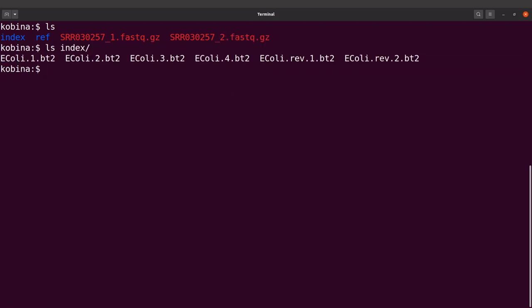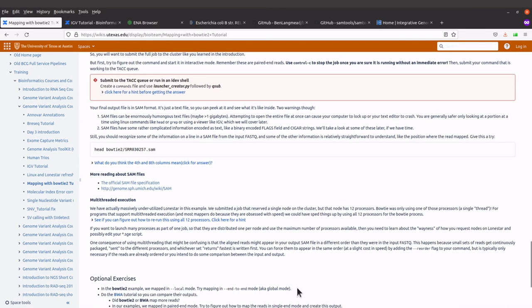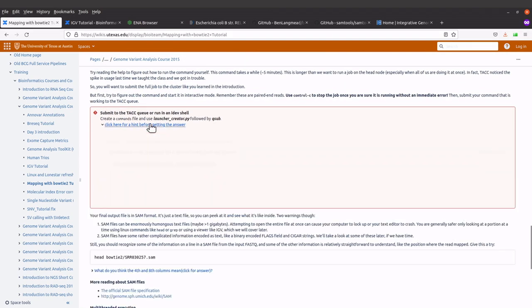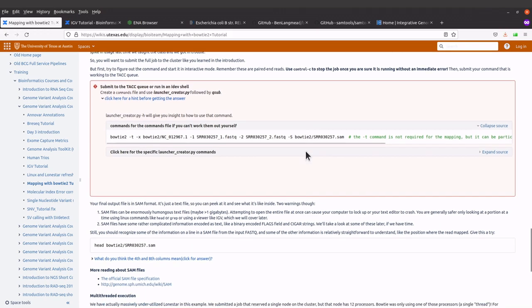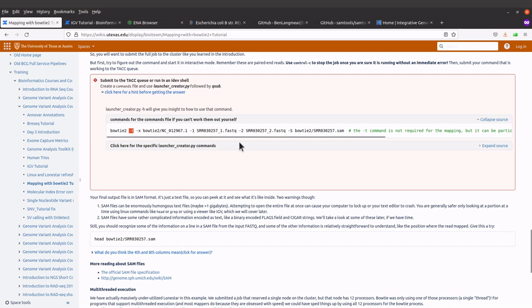Now we're going to perform the mapping. Let's check the command used for genome mapping from the tutorial page. The command calls bowtie2, then specifies the index, then -1 and -2 for the paired reads, and also the output file. The -t flag we're not going to use in this tutorial — we don't need it. Let's go back to the terminal and continue with the exercise.